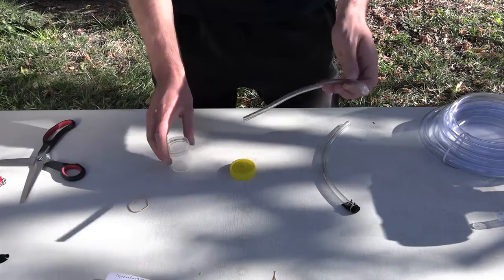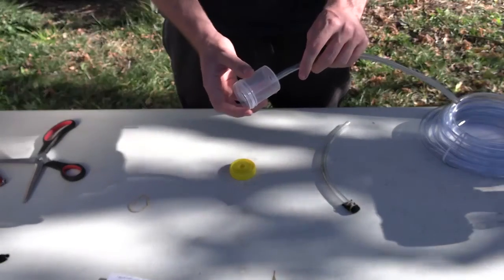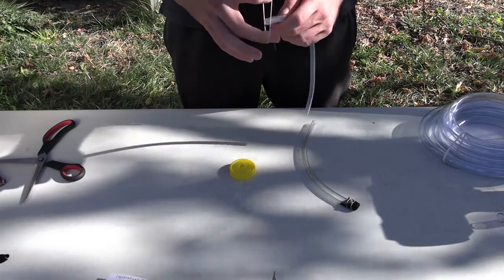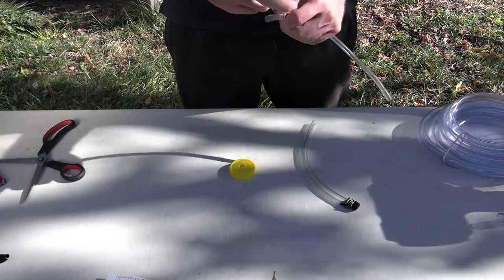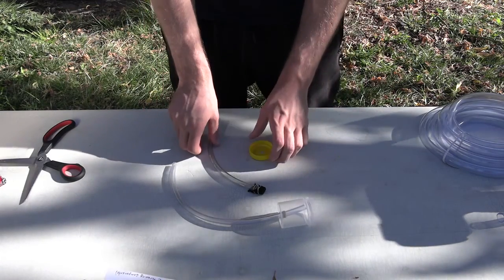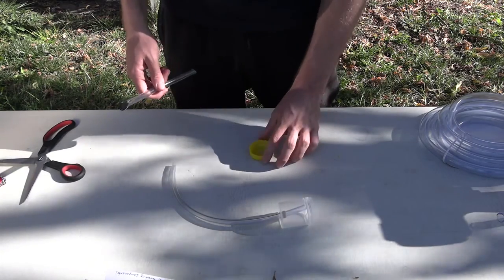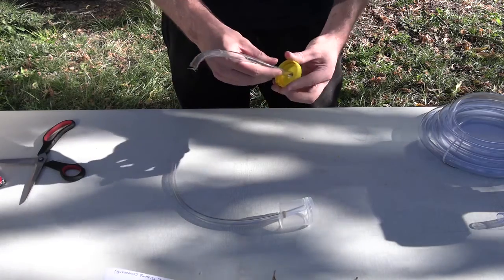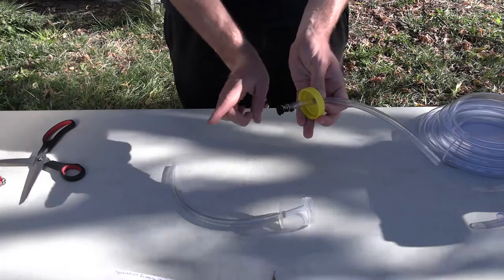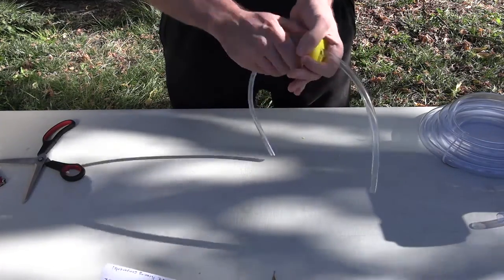First we're going to grab the bit of piping that doesn't have any cover on the ends and put that in the container section like so. This one's a little bit loose, so we're going to tie a rubber band around the inside so it doesn't slip. Now we're going to assemble the lid — grab the bit of piping that has the cover on one end and place it through the lid. Make sure that the covered bit is on the inside of the lid. Now we're going to screw the container together and there we go.